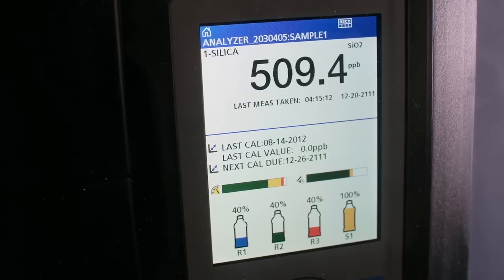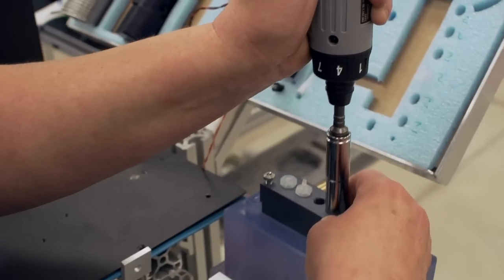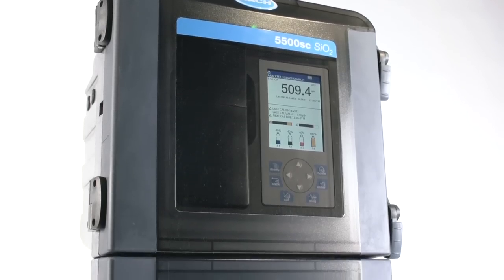We thought bigger, like a bigger display screen. But we also thought smaller, like a smaller footprint. This is how we work. This is how we build. This is how we improve on 20 years of excellence. Introducing the new and improved 5500 SC Analyzer from Hawk.